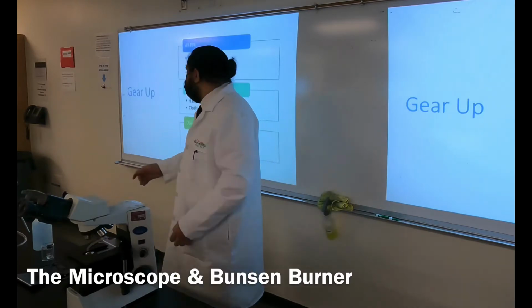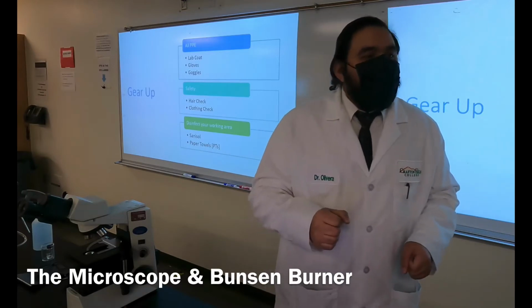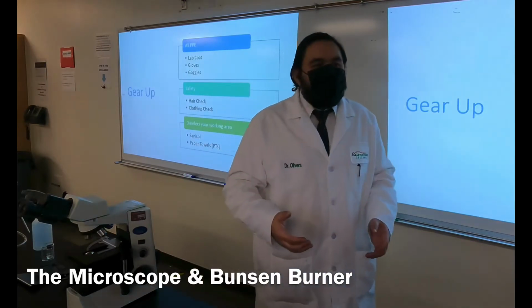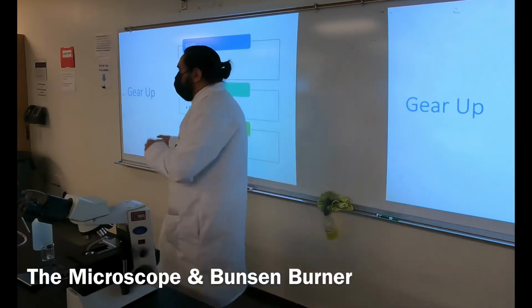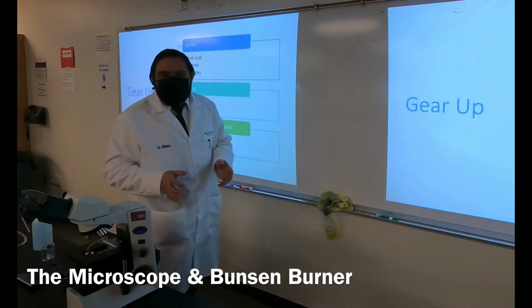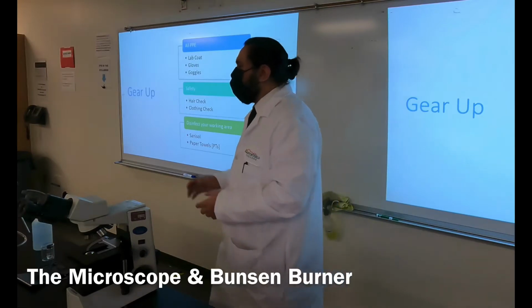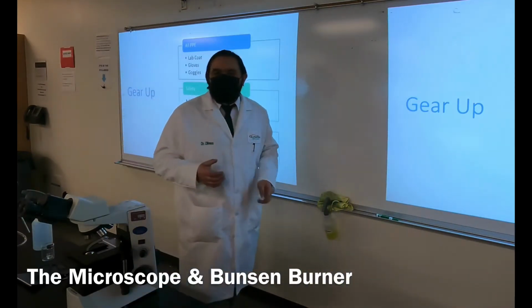So let's start off with that really quick. Find the area where you are, find that little Sanisol substance, and spray that area, just the fourth of the bench that you occupy in your spot. Let it sit there for a little bit. Grab a paper towel, you only need about an 8.5 by 11 size. Wipe it down, and then you can put that paper in the regular trash. Let it sit just a little bit, enough to kick in, and then you can put it away.